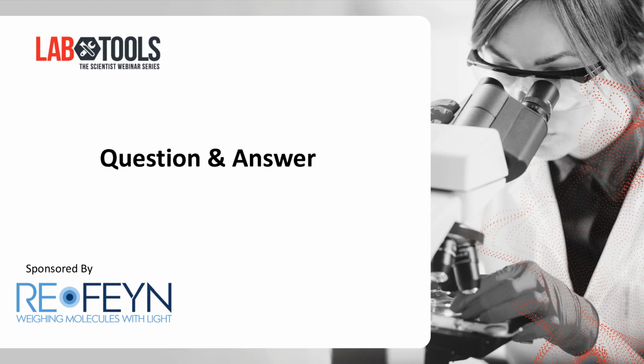Yeah, so basically our thoughts with that are, like I said, if you're interested in mass measurements, we really think these single particle methods are the way to go. Because when your proteins are heavily glycosylated, the conventional mass analysis approaches really don't work very well. So we think these single particle methods are essentially tailor-made for those types of systems.